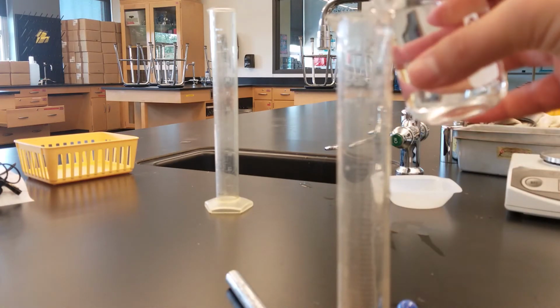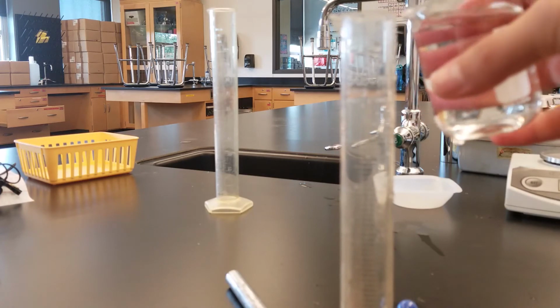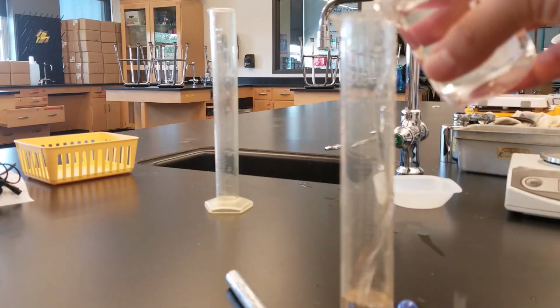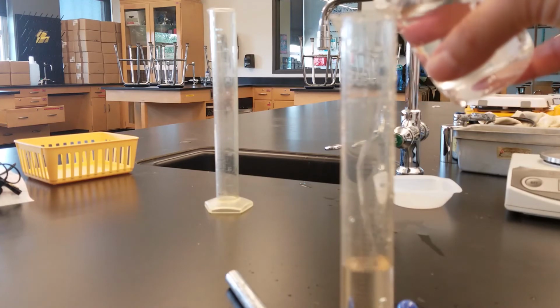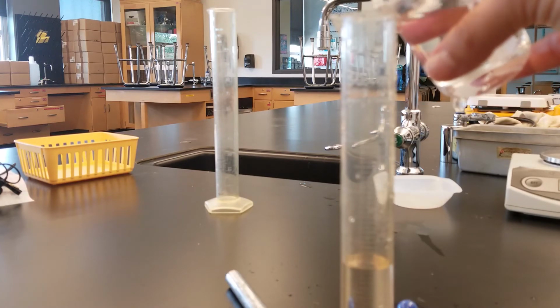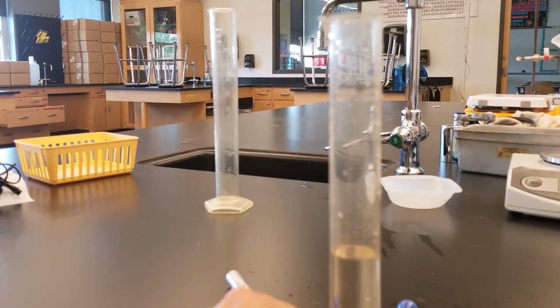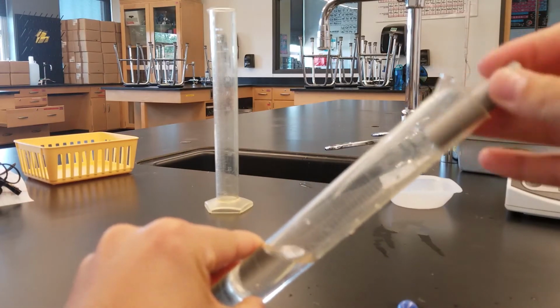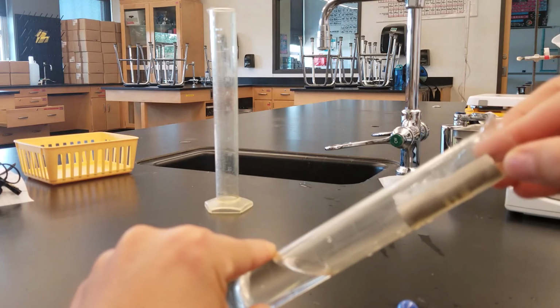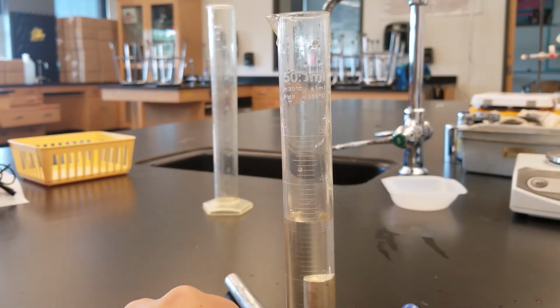You need to repeat these steps for the next 3 objects. Object number 2 is the silver colored rod. Turn your graduated cylinder at an angle, slowly slide the object into the graduated cylinder, reading the new level.